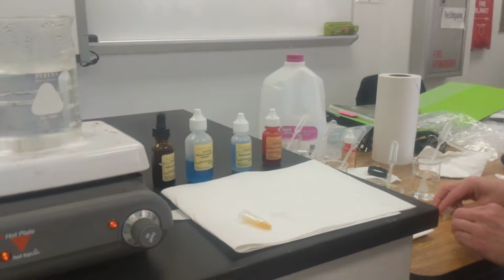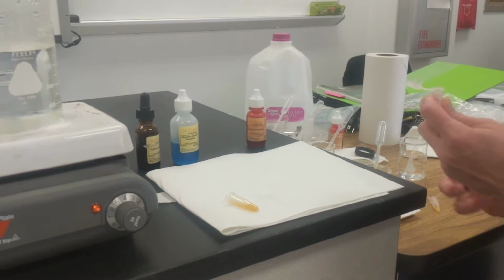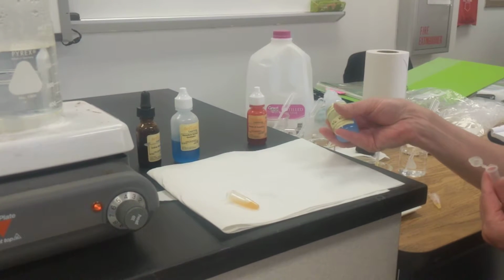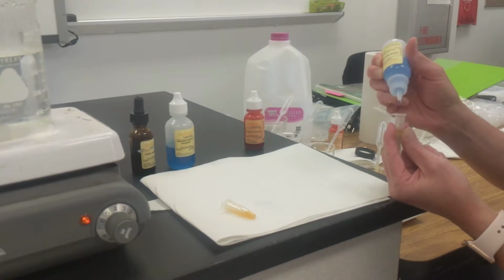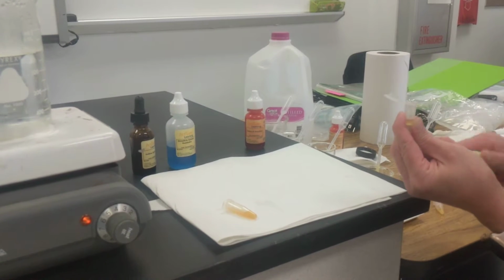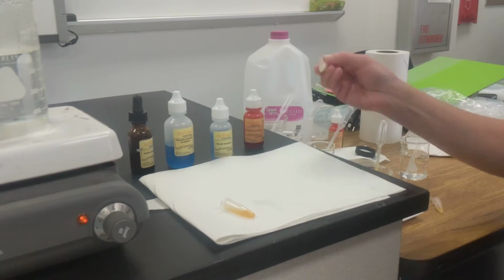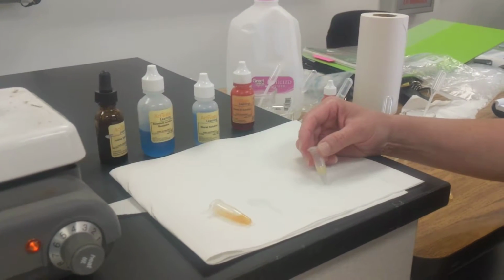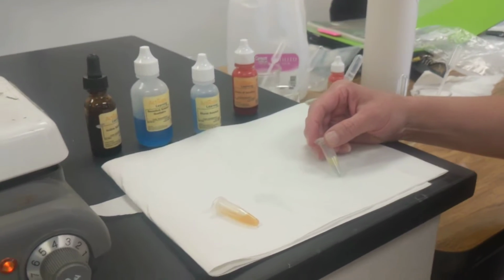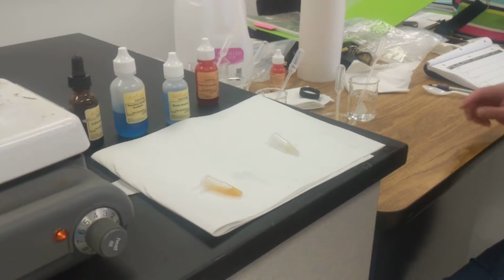Our next is going to be our Biuret solution. That's also light blue, okay? We're going to put that in there. Remember, we're looking for protein. Shake that up pretty good. And it's looking kind of greenish, maybe, and it may be coming out kind of greenish because the butter is yellow and the Biuret solution is blue, okay? But we'll leave that sit there for a moment just to see if anything's changing.